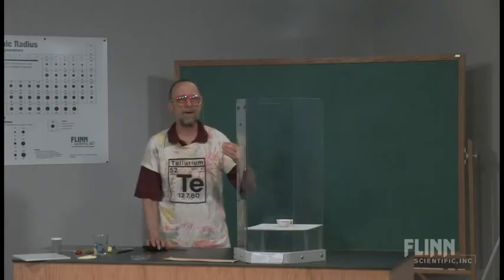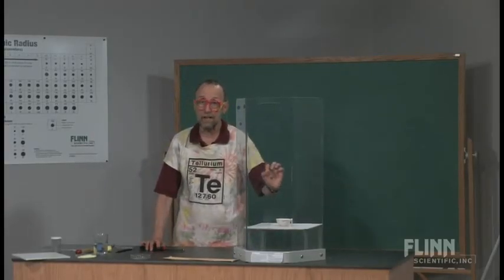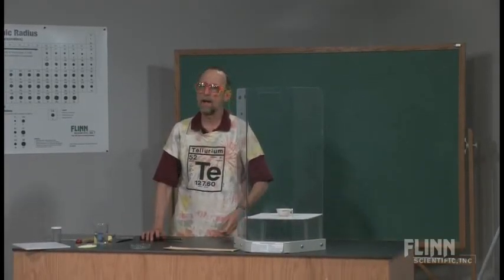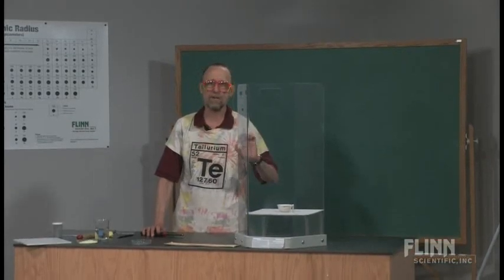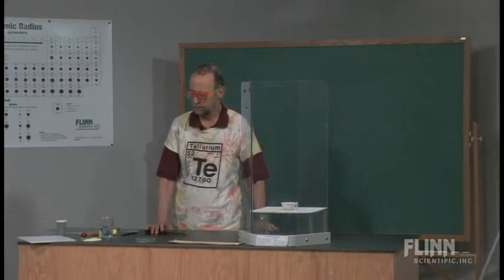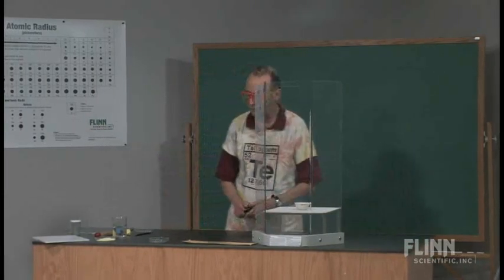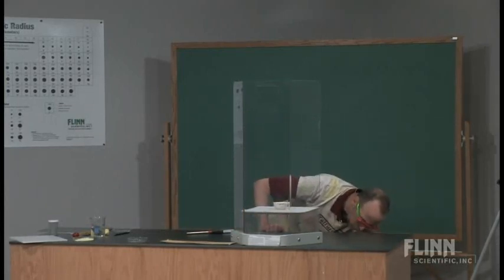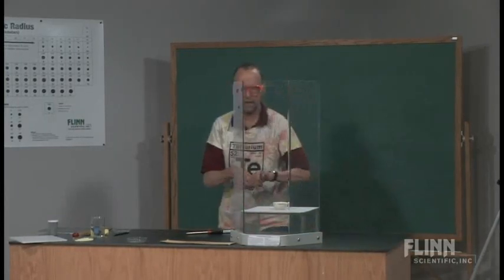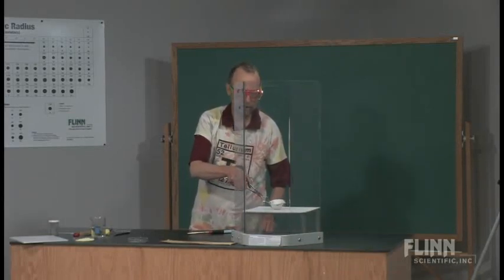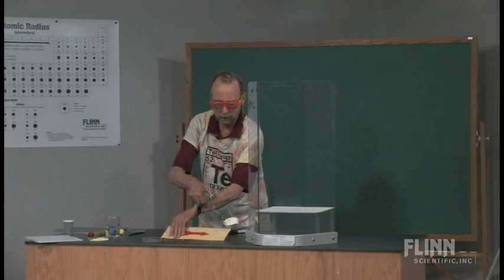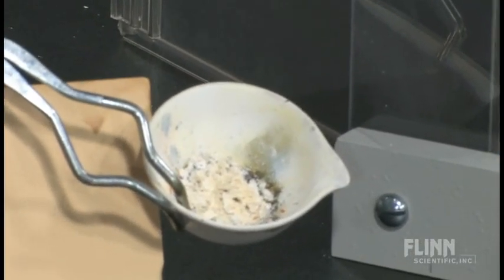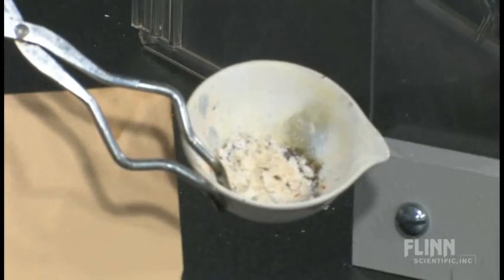Now, you heard the vent go on, and it's a good idea to do this in the hood. Or this one, you might even be able to take outside and do, depending upon your situation. I would not do anything unless it was an incredibly small amount in my classroom. Let's see if we can focus in on the contents there. I'll see if I can bring it from behind here. And we can see what the products look like. So we yield or produce this zinc sulfide. Something, as Monty Python would say, completely different.